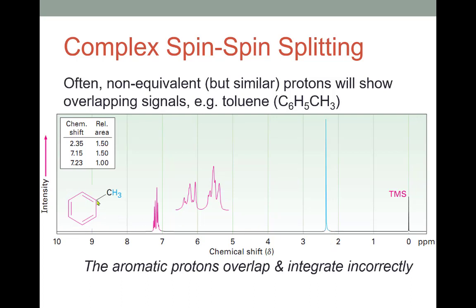And then we have the aromatic ring protons. Now, sometimes it's easy enough to just say, okay, this blob here, that's aromatic, so that's all I care about. And in fact, if we were given the formula for this thing, we would look and say, oh, that's an aromatic ring, no question. That takes care of C6 at least. I know I have another carbon, that must be over here. Let's look at this. Does that make sense? It kind of does. So we have the aromatic ring, and we have one other signal.